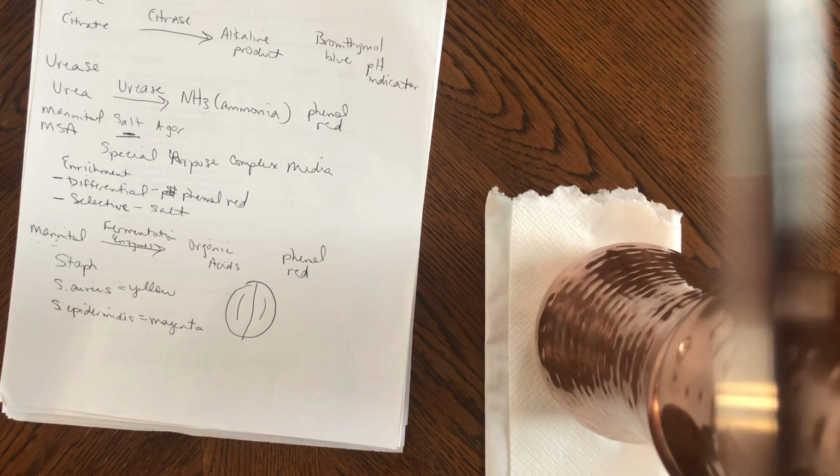And that's based on the type of hemolysins or hemolysins. It's the same word, just pronounced differently, which are the enzymes responsible for the hemolysis, which is the lysing of the red blood cells. So it can differentiate between alpha, beta, and gamma hemolysis based on the hemolysins, the enzymes in the bacteria, to display the different type of hemolysis.